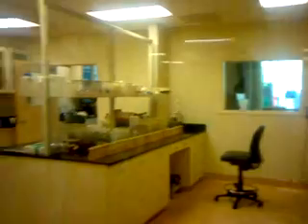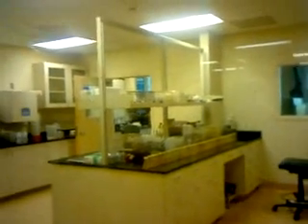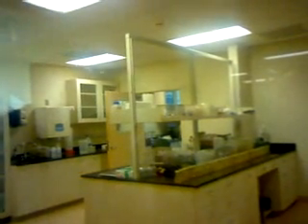Yes. Thanks. This lab is the mineral laboratory. So we check all the numbers of the minerals here. The difference between the two labs, well, the instrument for the minerals use high temperature, and for the vitamins and herbals, the instruments use high pressure, air pressure. That's the difference.